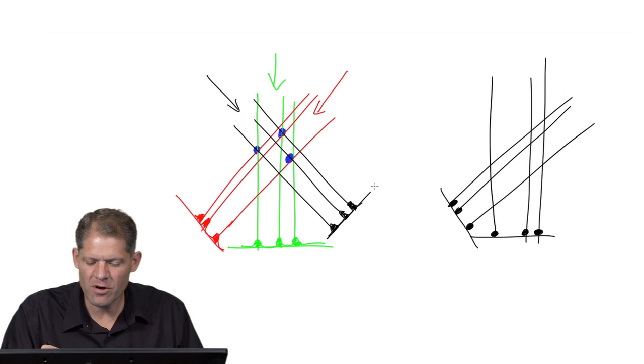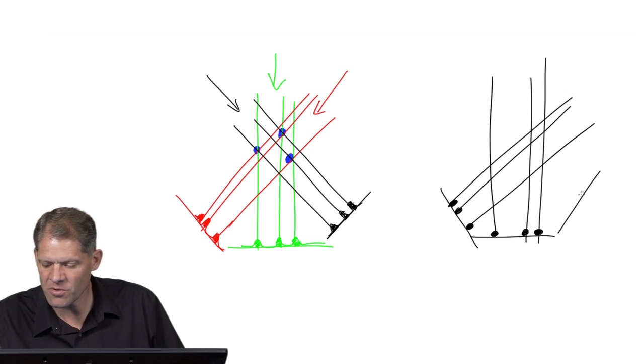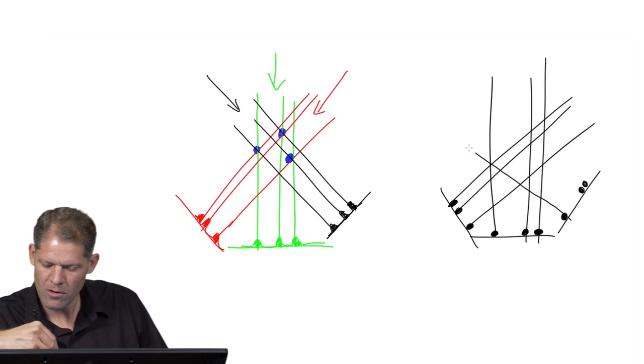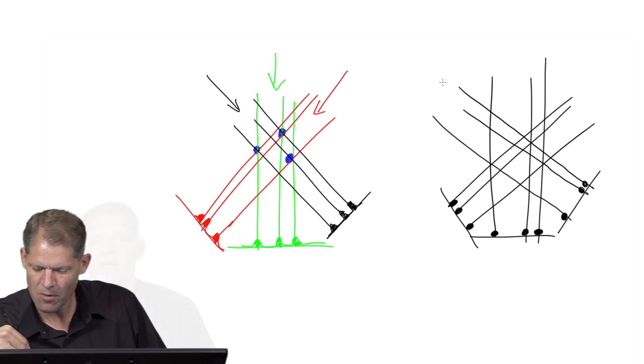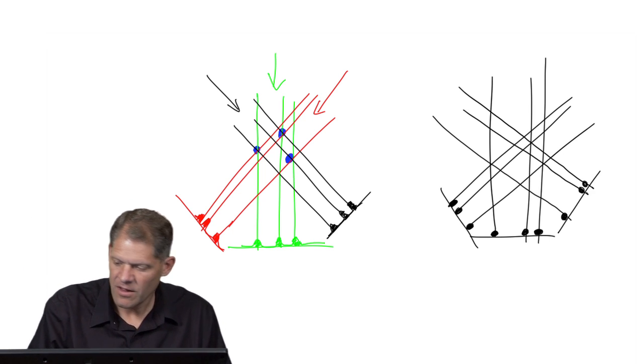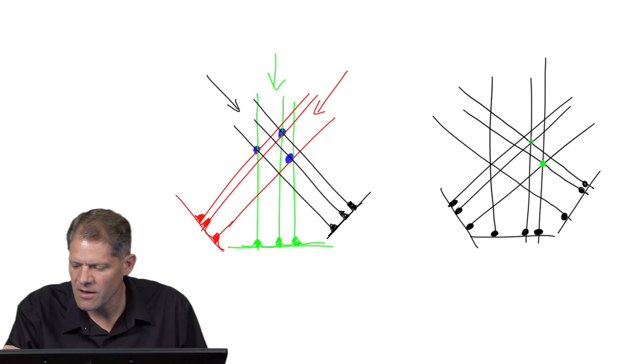But if we take our third projection image, and again assuming we know what direction it represents compared to the other two, and it had a density here, and here, and here, and then we back project this through the reconstruction volume. Now when we look into the reconstruction volume, we find that there are three positions that are the intersections of three lines. So here, here, and here.